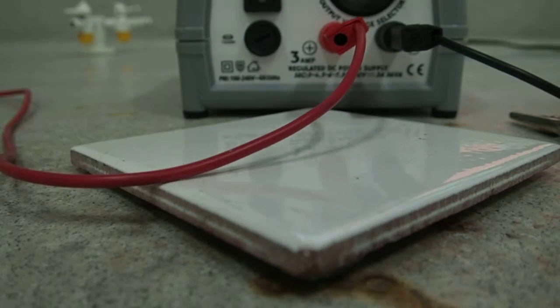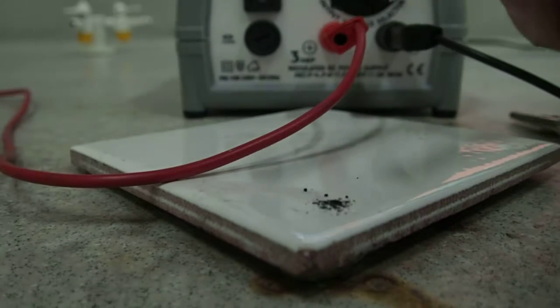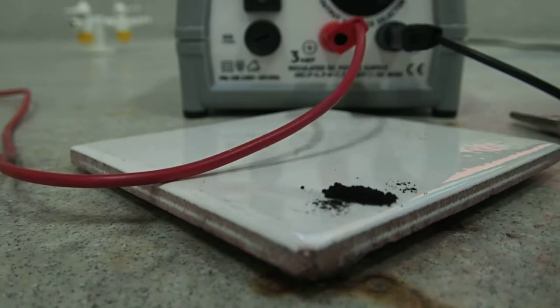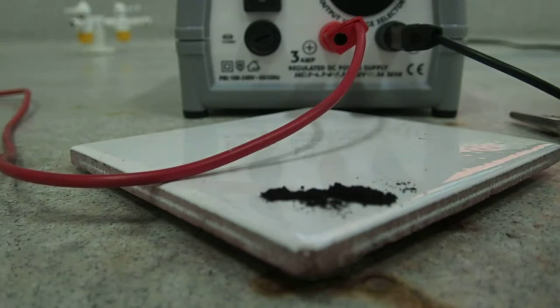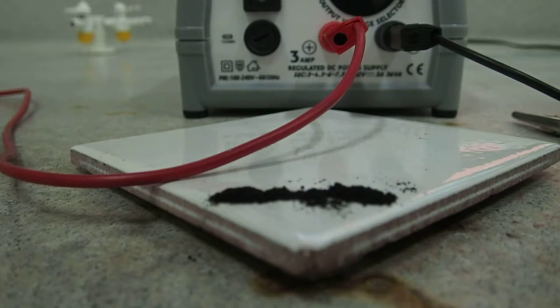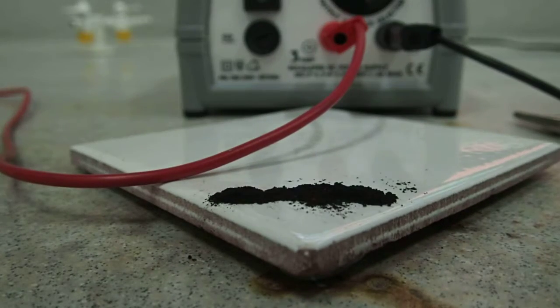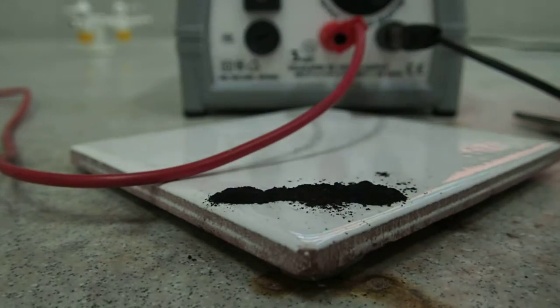This is the small scale or micro scale extraction of iron from iron oxide. The first thing that we need to do is put a little bit of our pre-prepared mixture of iron oxide and carbon along the edge of the tile here in a nice little line.